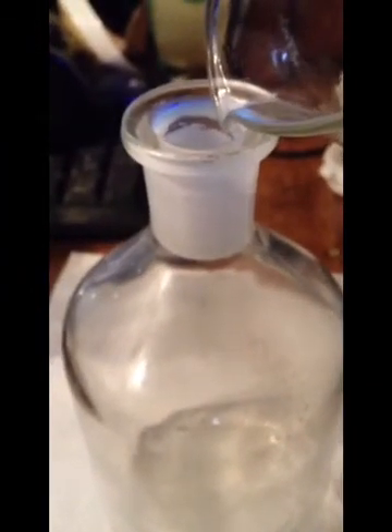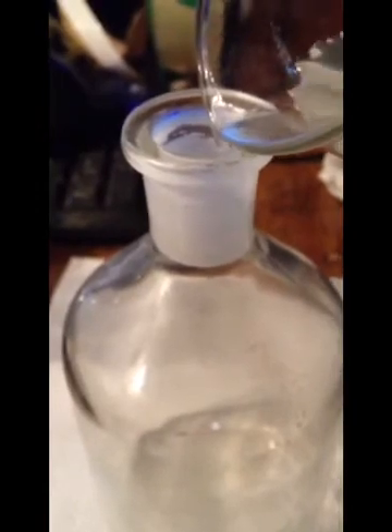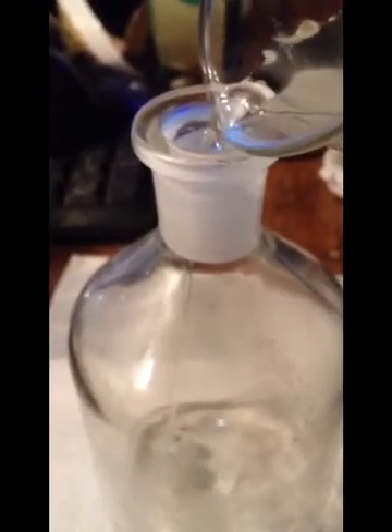Now I'm going to pour off that top solution into this bottle. There's still a lot of potassium hydroxide in there, so I'm going to recycle this. I'm going to use this and then just add a little more potassium hydroxide next time before doing it again.